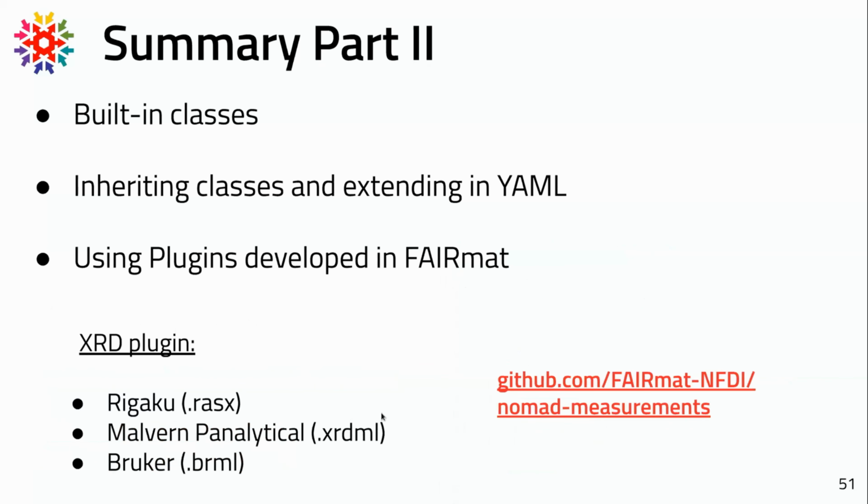So the last part of this demo was showing one of the plugins as we developed it. In this case, it was an XRD plugin. We have a dedicated repo where this code is contained. If you want to take a look at that, you can even clone it and maybe load it in your NOMAD Oasis.